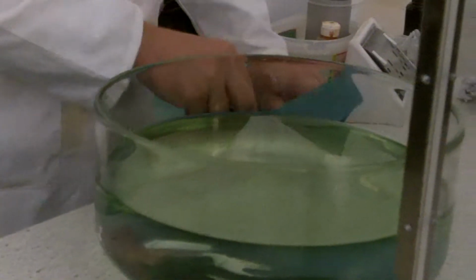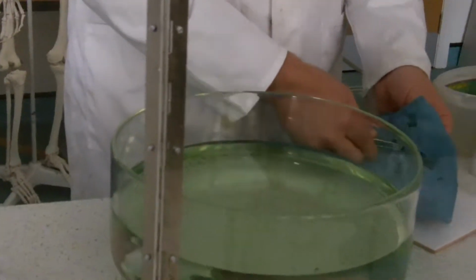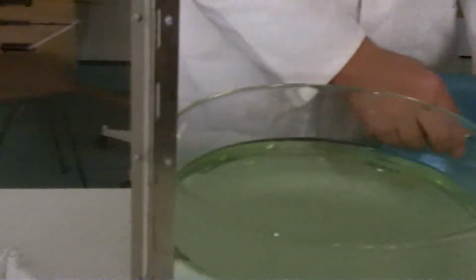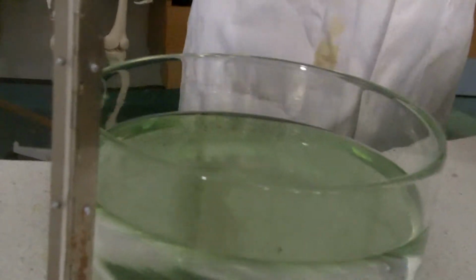We'll try and do this as quickly as possible because I don't want to spend too much time. But I'm going to get you guys to stand back a bit because it is an unpredictable reaction. Lots and lots of horror stories in terms of teachers doing this. At the last school I taught at, I had burn marks on the ceiling, on benches, everywhere. People have a tendency to be set alight, which is not very pleasant.